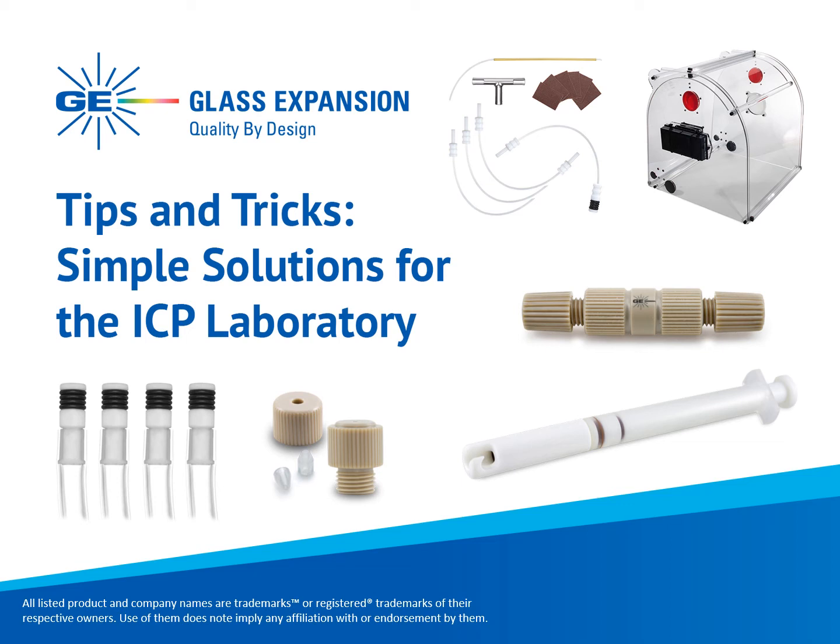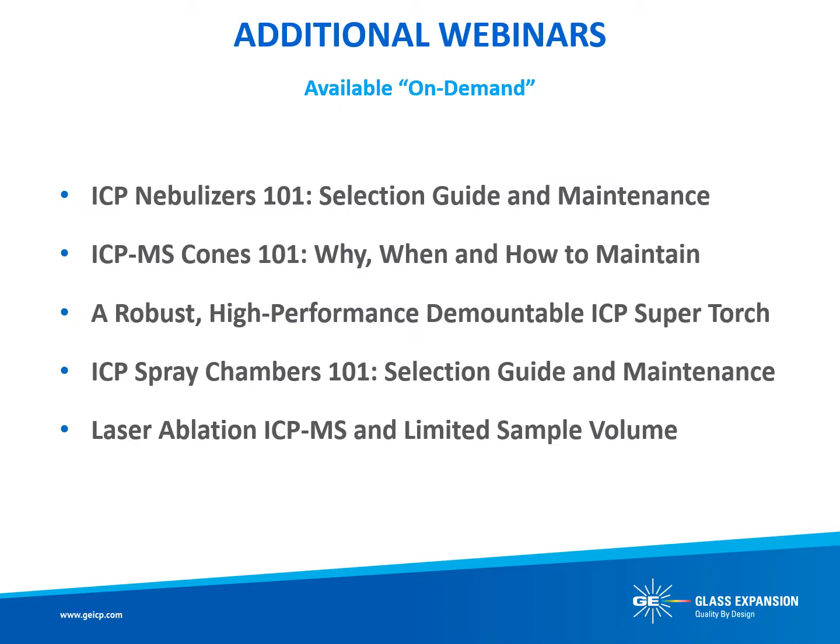Today, we will be discussing many of the smaller and often overlooked accessories for ICP analysis, as well as different features of the Glass Expansion website that will help you find the correct part and optimize your ICP performance. Much of the information that will be presented today is discussed in much greater detail throughout our webinar series.